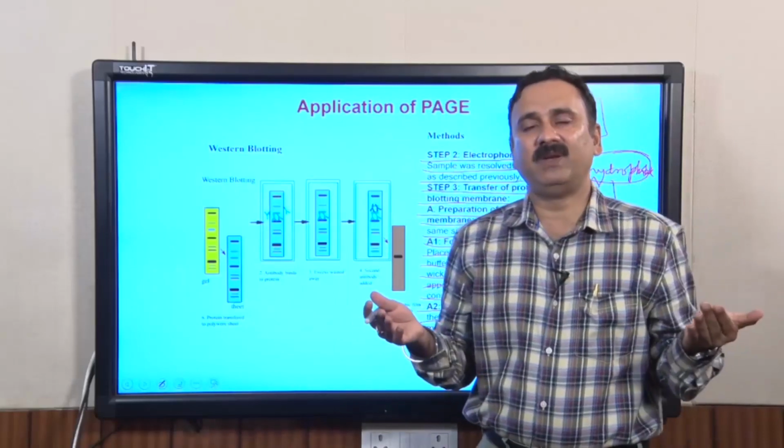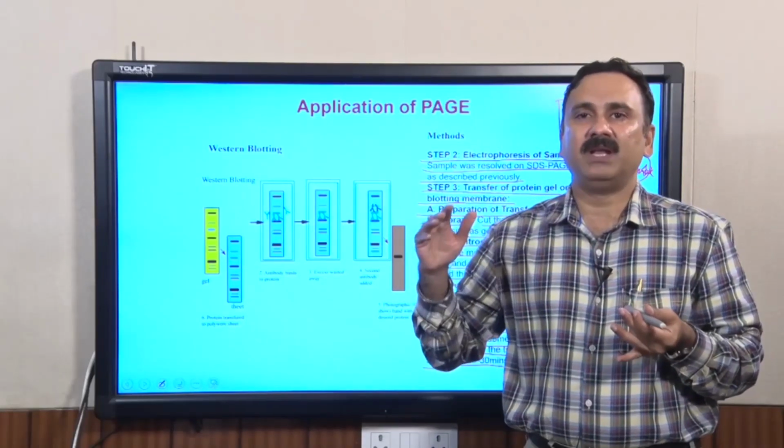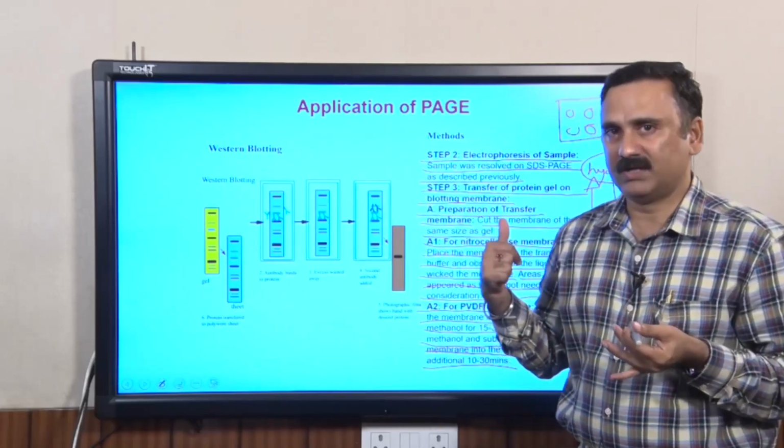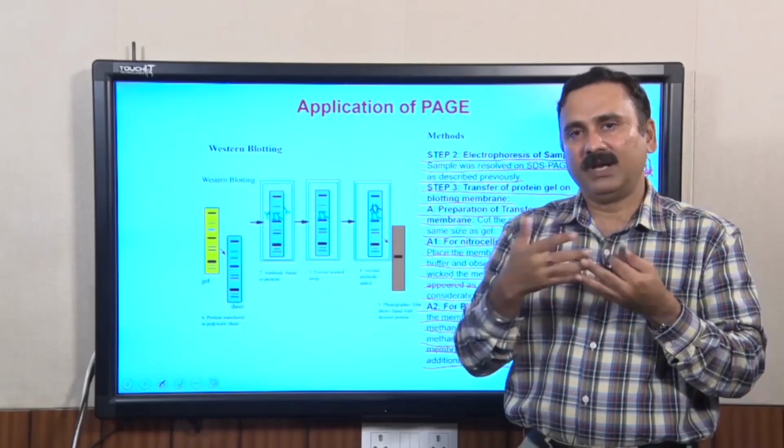Otherwise, if you use the PVDF membrane without this particular step, the PVDF membrane is not going to bind the protein, or even if it binds the protein, it may not be evenly distributed.